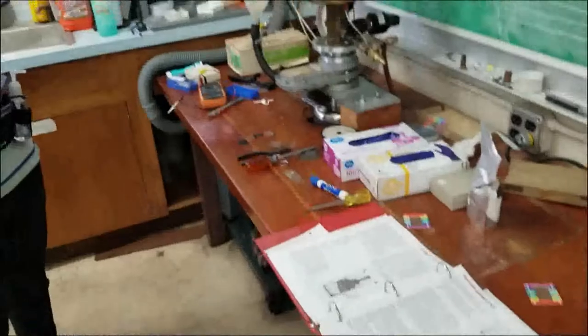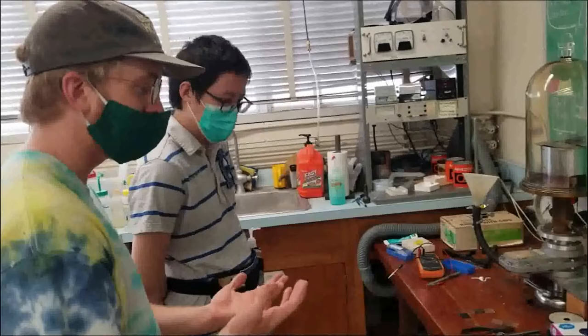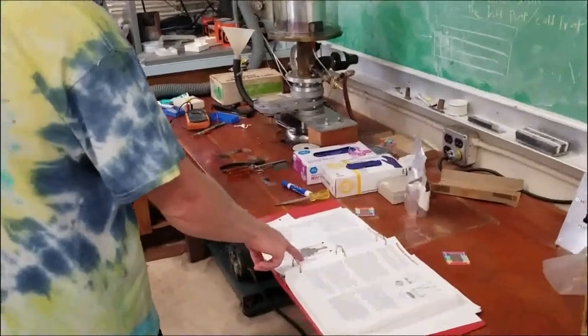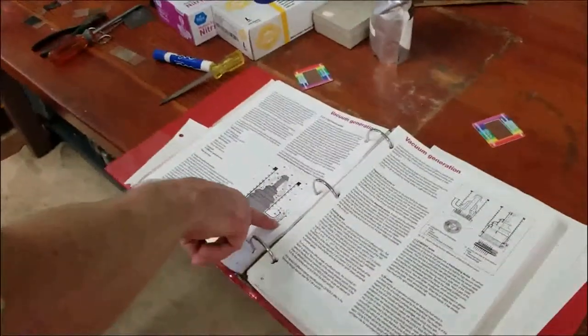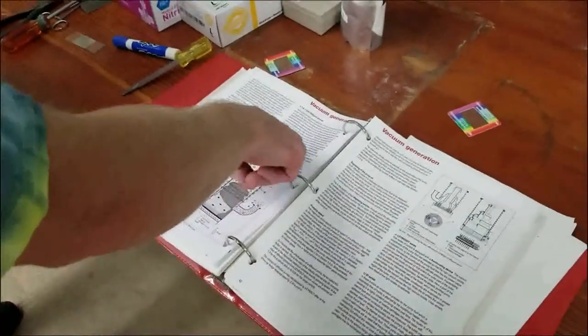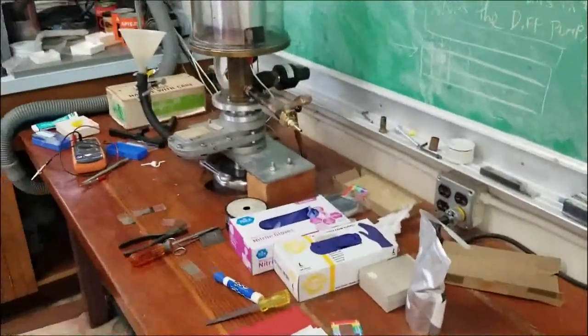So the only real limit to the diffusion pump is you have to turn it on at really low pressure because otherwise it won't move very much gas in terms of volume. And you can't let the pressure build up too high over here. If the pressure builds up too high over here, it shoots the oil up and it will get inside our container and contaminate it.